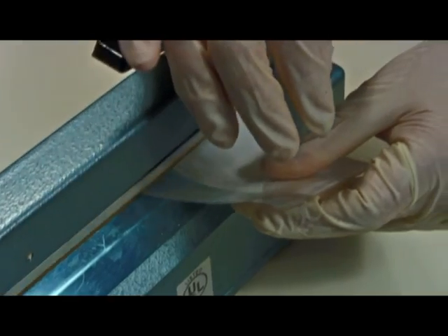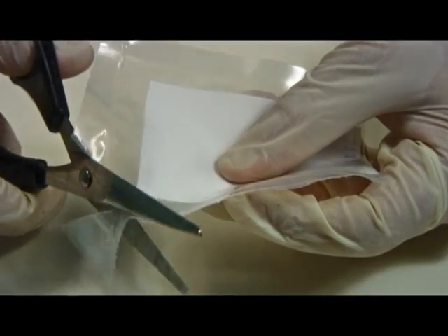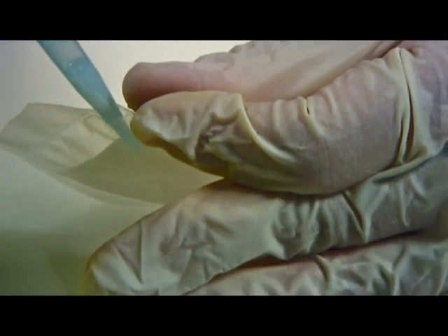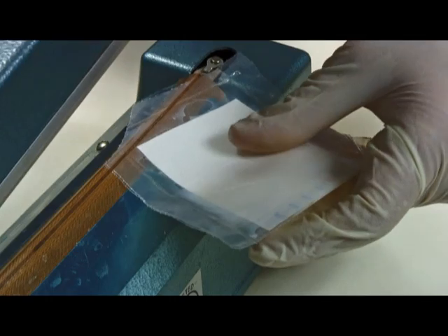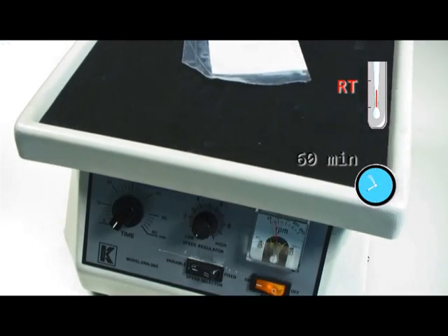Put the membrane in a plastic bag made with the sealer. Seal it completely. Then, with the scissors, cut a little hole to introduce the tips of the micropipette. Add the primary antibody into the plastic bag with a P1000. Seal the bag. Incubate it in an orbital shaker at room temperature for 60 minutes.